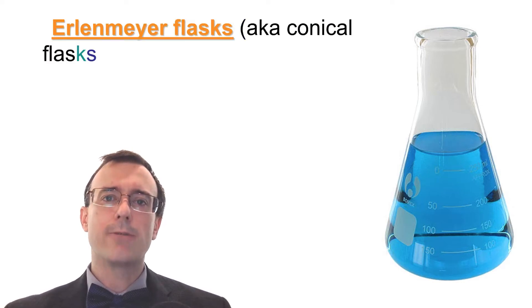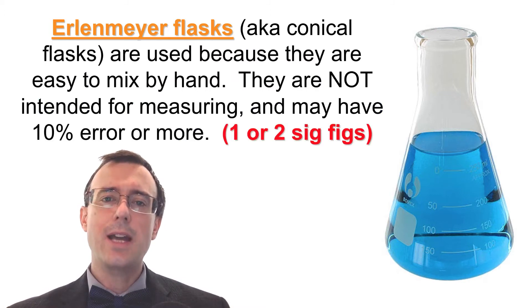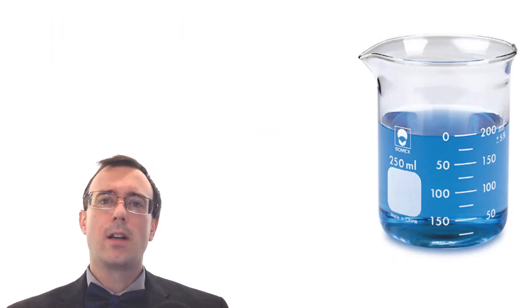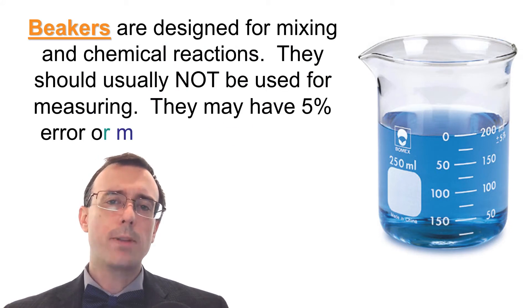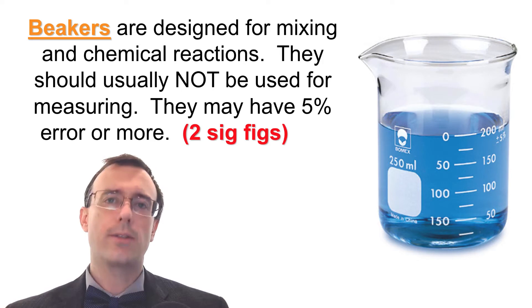There are a lot of things around the lab to measure volumes of liquids, but we shouldn't use all of them. The Erlenmeyer flask, also known as a conical flask, is used because it's easy to mix by hand — it should not be used for measuring volumes. If you do use it, you'll have 10% error or more, meaning only one or two significant figures. Beakers are designed for mixing and chemical reactions and also should not be used for measuring volumes, typically giving 5% error or more — no more than two significant figures.